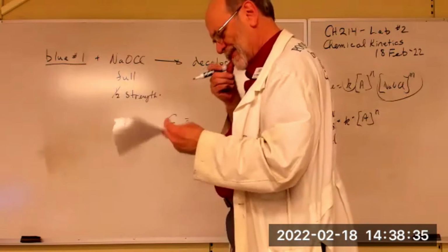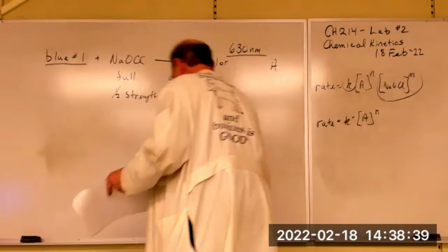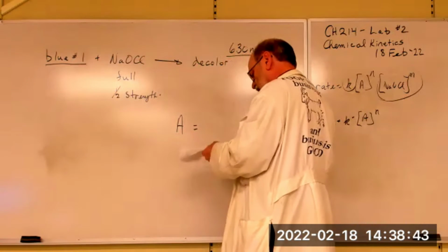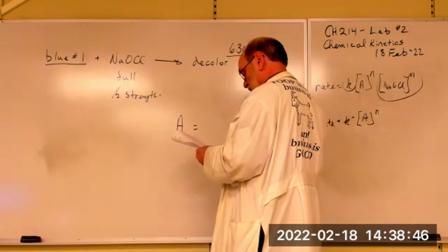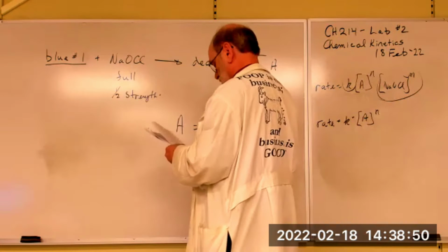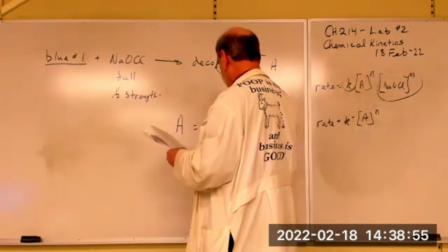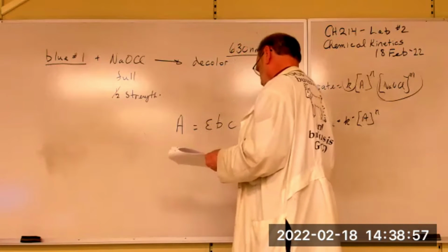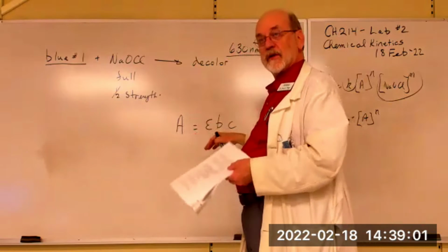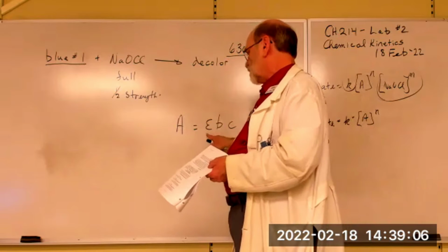Beer-Lambert law. So it's not concentration, it's the absorption. It is based upon the molar absorptivity, the path length, and the concentration. So here's the concentration of the chromophore, whatever absorbs the light. This is the path length, and this is the molar absorptivity.